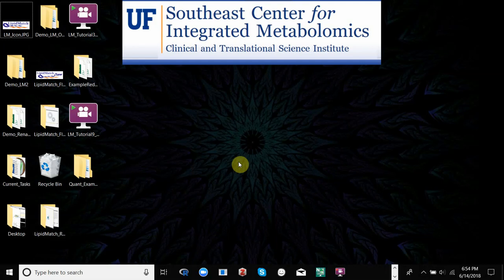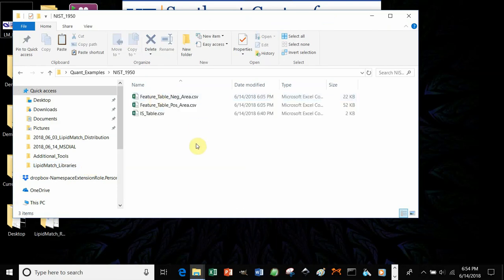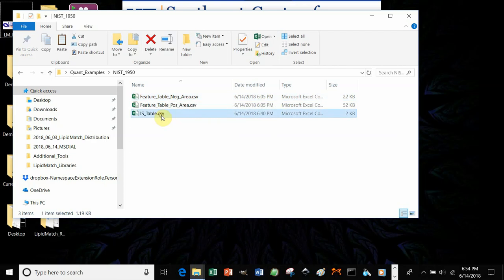Today we're going to go over how to normalize your peak areas, intensity values, and maybe peak heights that you got using the LipidMatch workflow, by using class-specific internal standards. The files you'll need to run this script are either negative, positive, or both feature tables and the outputs from LipidMatch, and an internal standard table.